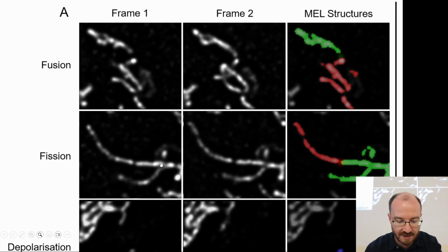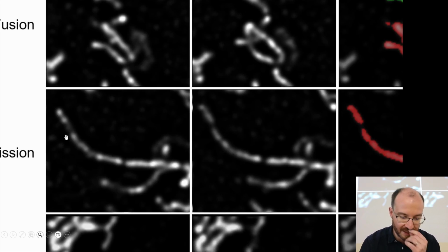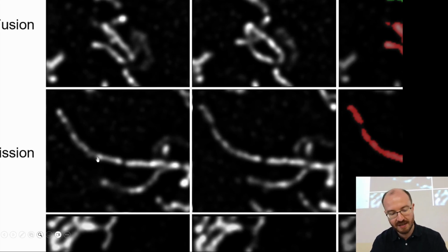On the flip side, if I had something like this, where again they're not joined, but they're pretty close, because I need to get this entire leg as one continuous structure, I had to take my segmentation to be quite a low threshold, and then this becomes joined. And now that they're actually moving further apart, the segmentation no longer confused it, and now it says, hey, there was fission, but actually there never was.